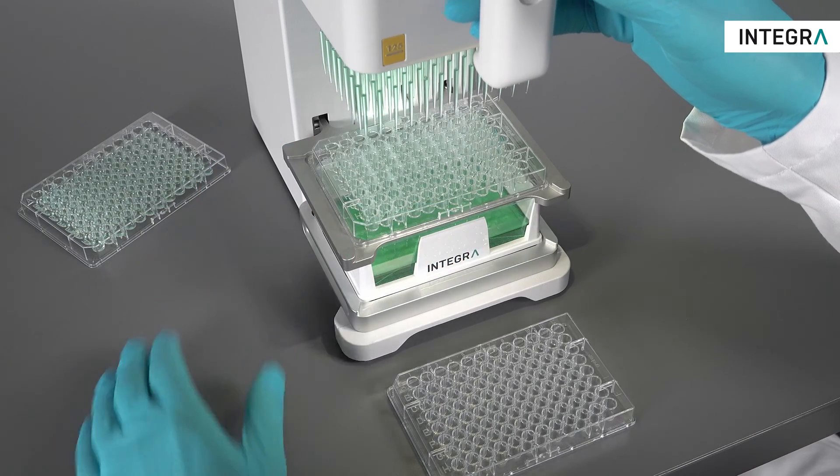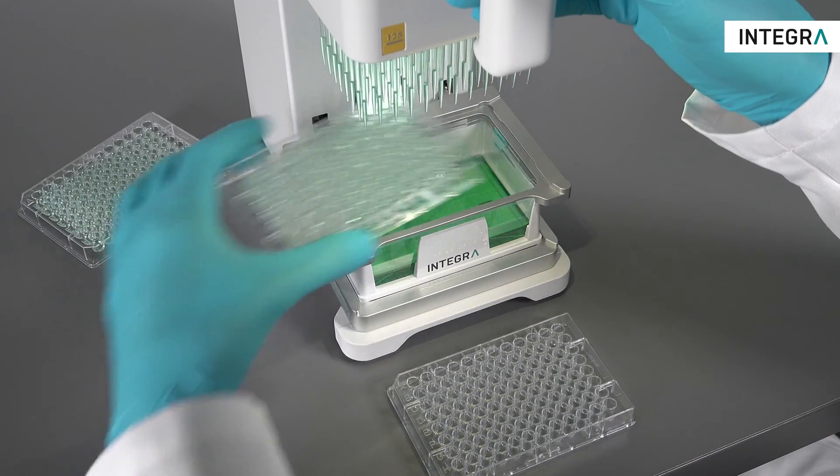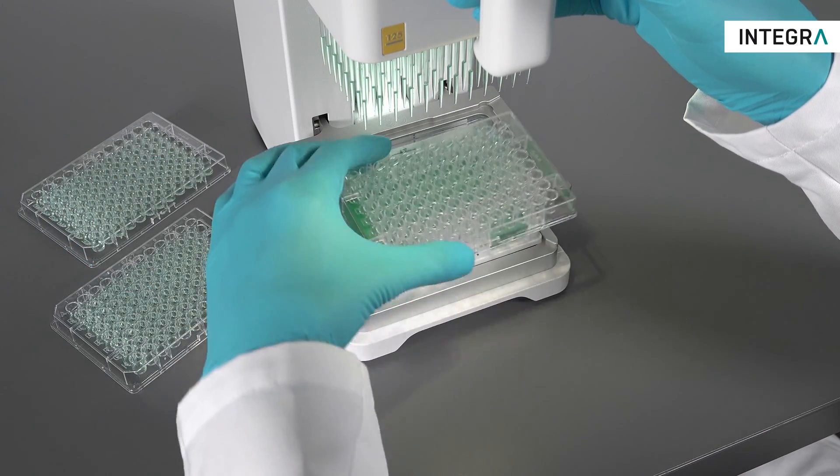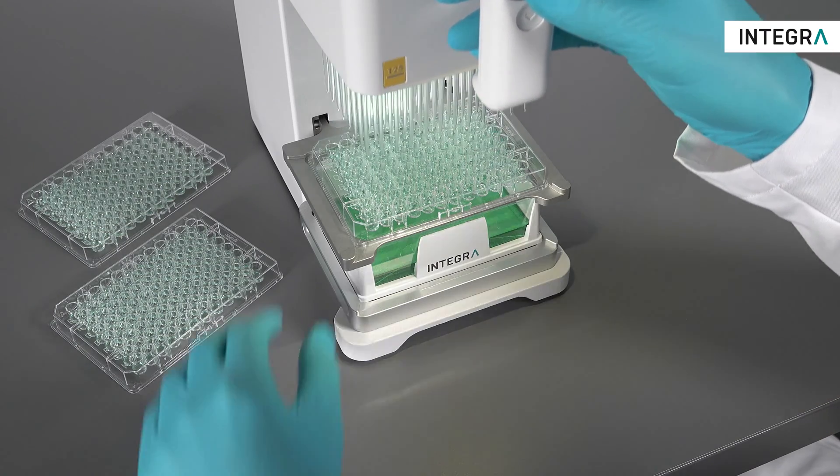What can the MINI 96 do for your lab? Simply put, it means an incredible increase in productivity for a tiny price, all in a small package which can be accessed anywhere in the lab by anyone.